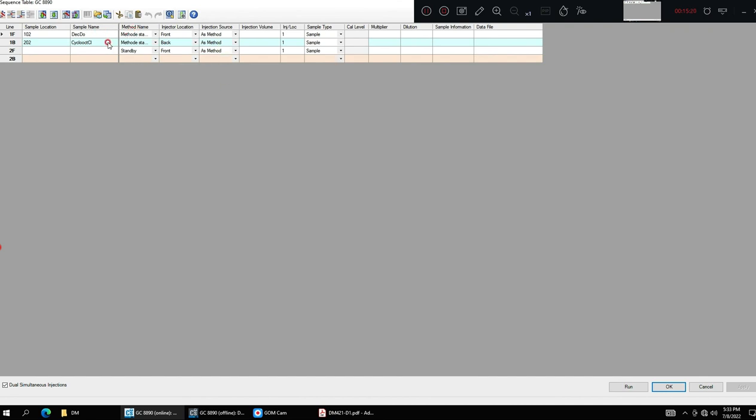And you can see you can change names. Here you can write whatever you want to. So how does it work here? So 1 is the front column. It's also shown here. 1 front, 1 back. 2 is the back. So the position 101 would be the front column, the first position. 201 would be the back column, the first position. And so you have to alternate all the time, front, back, front, back, front, back.